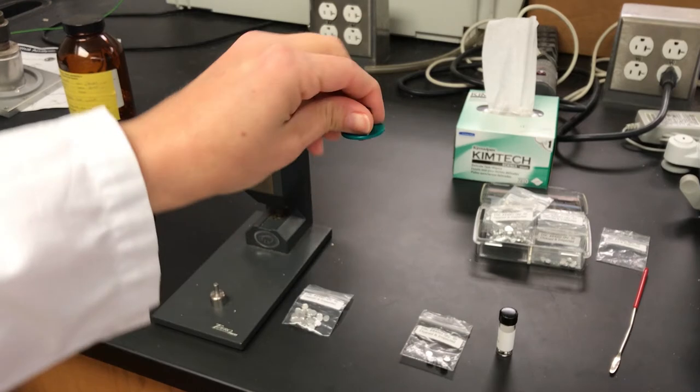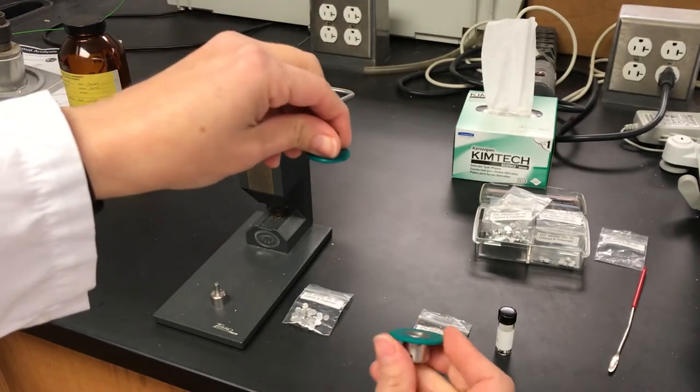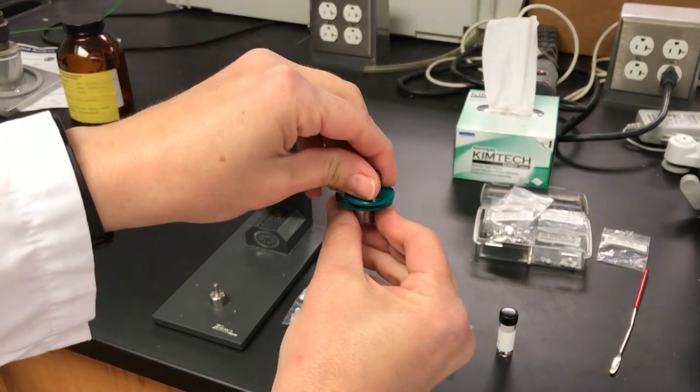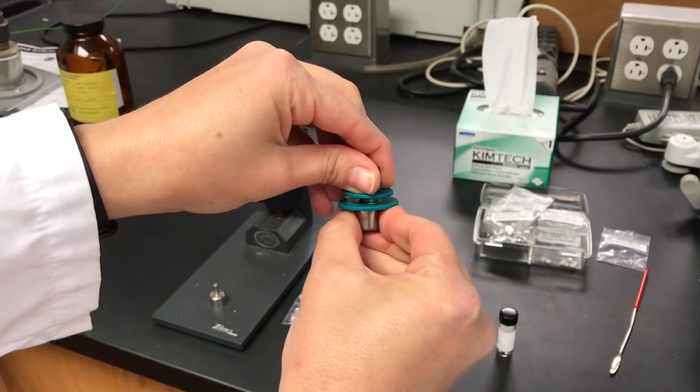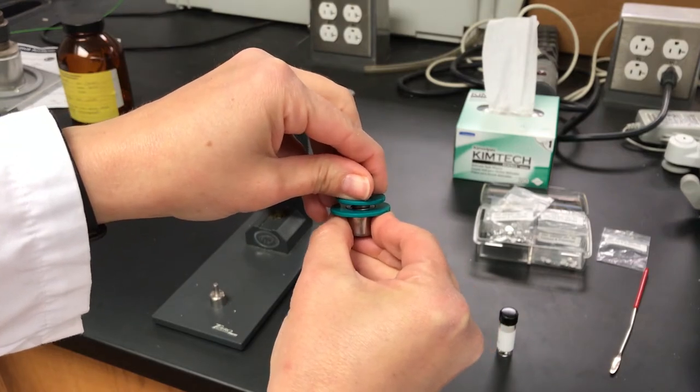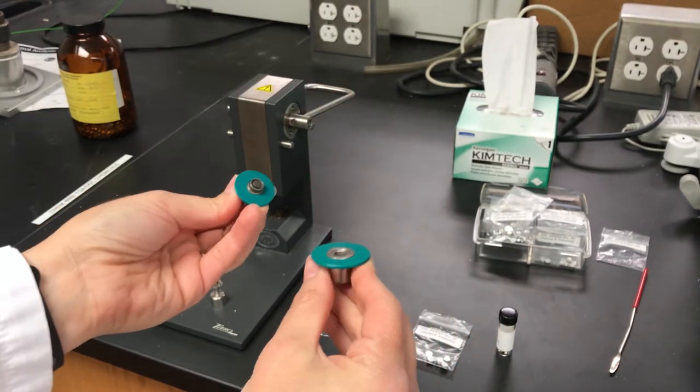So here's the top of the press and the bottom. And it's just going to press the sample or the lid and the pan together and make a nice seal.